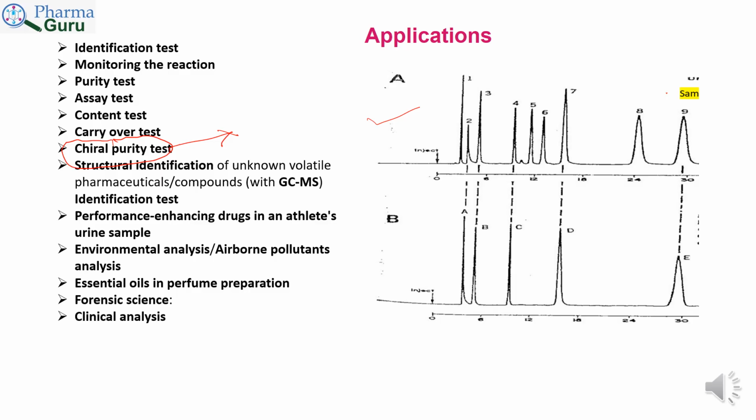Then after sample is injected, then RT of any component or required component is correlated with RT in the standard chromatogram, and then component is identified based on matching of the retention time.